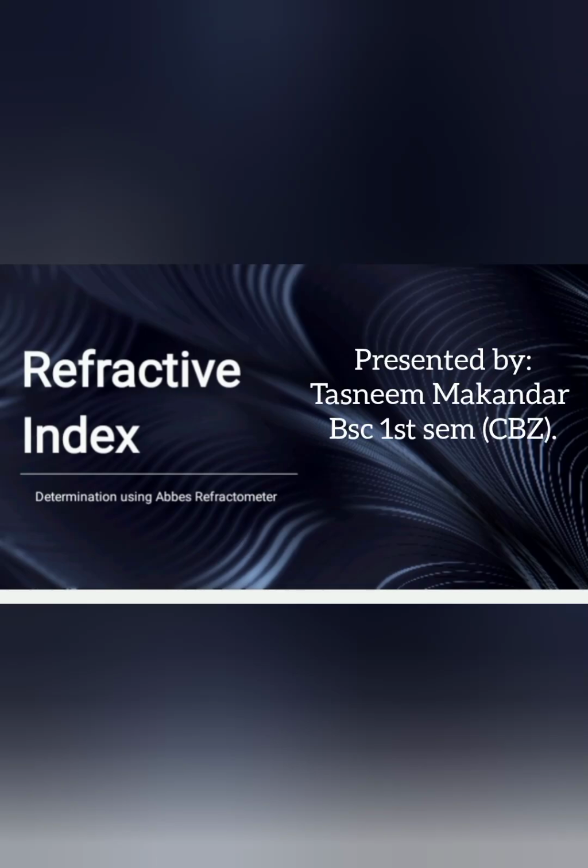Myself Tasnim Makandar from BSc First Sem CBZ combination. My topic is to determine refractive index by using an Abbe's refractometer.